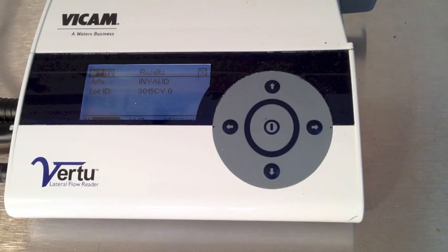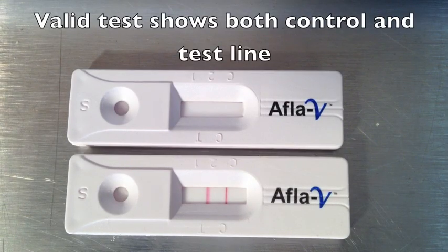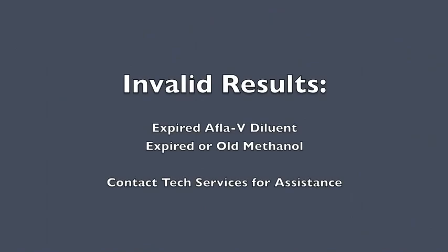If the display shows invalid, something has happened to the strip test. A valid strip test will show both a control line and a test line, as shown in the lower strip. If you're missing this, you may have to check your diluent or perhaps you have old methanol. Contact Vicam Tech Services for assistance.